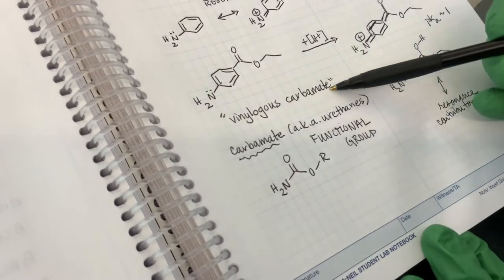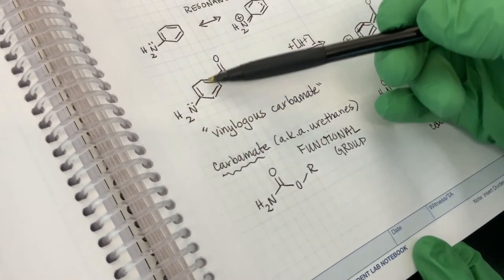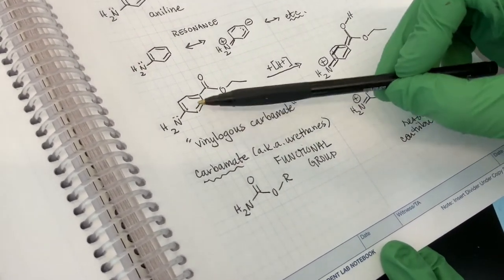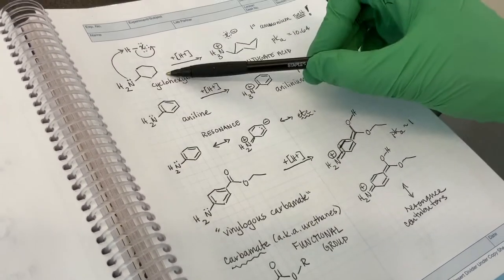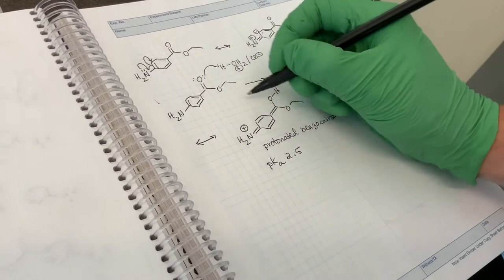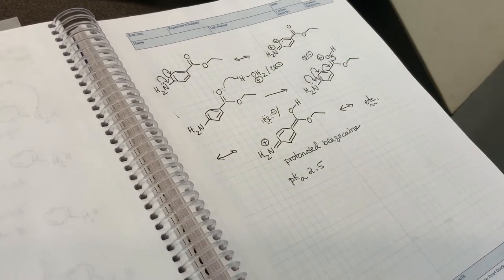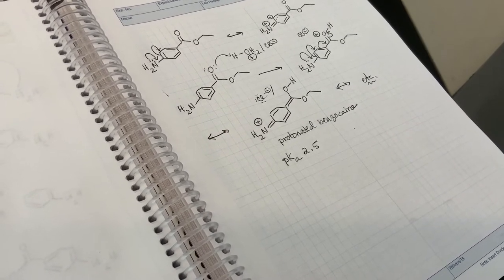So we're calling it a vinylogous carbamate because the nitrogen isn't directly bonded to the carbonyl, but it's extended through this pi network. And so this is one reason why we are going to rationalize that benzocaine is much less basic than not only aniline, but of course much less basic than cyclohexylamine. So this is the important theory to consider, but nonetheless, we're still going to be able to protonate benzocaine. And then when we protonate benzocaine, this salt, and we should show the counter anion, is much more soluble in the aqueous layer, the top aqueous layer, rather than the lower methylene chloride layer.